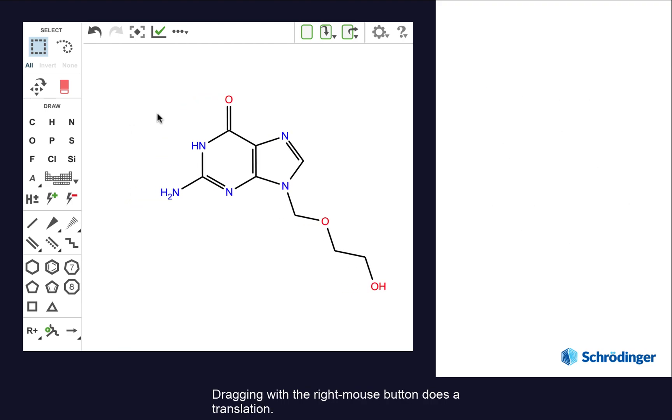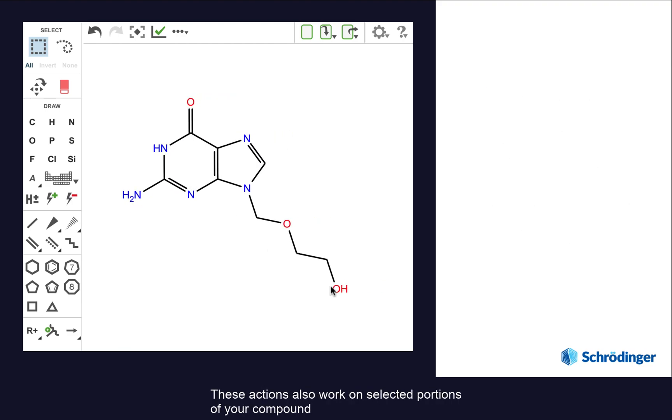Dragging with the right mouse button does the translation. These actions also work on selected portions of your compound.